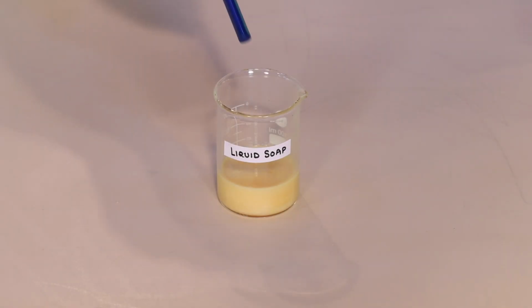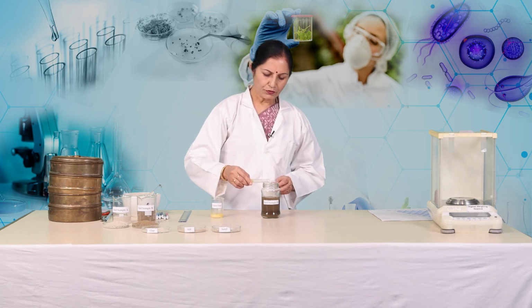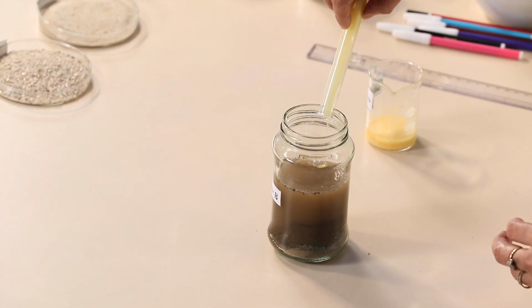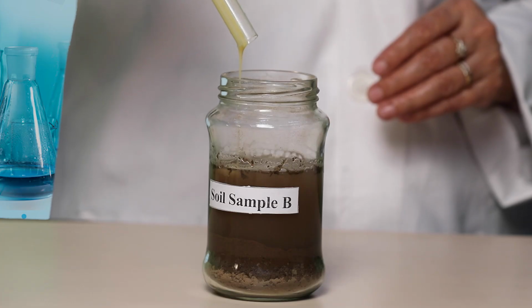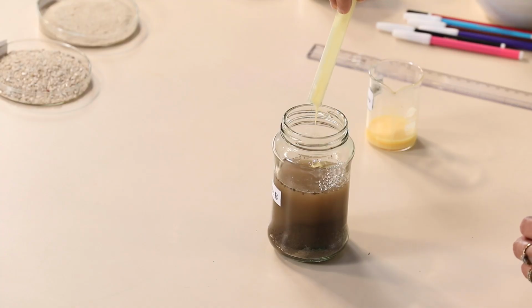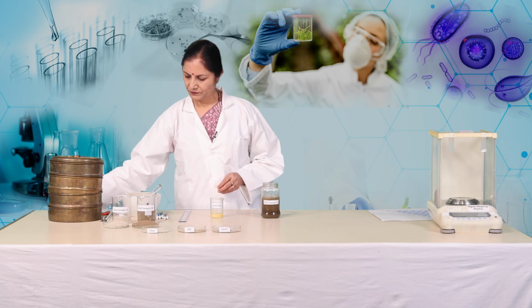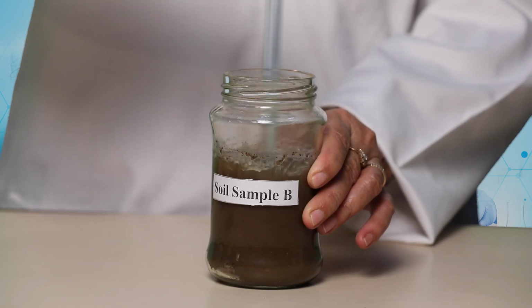Add about 5 to 7 grams of borax or 5 ml of liquid dishwash to the jar and stir the mixture properly. This is 5 ml of liquid dishwash. We have to add 5 ml of liquid dishwash into this mixture. Now, we stir the mixture thoroughly.